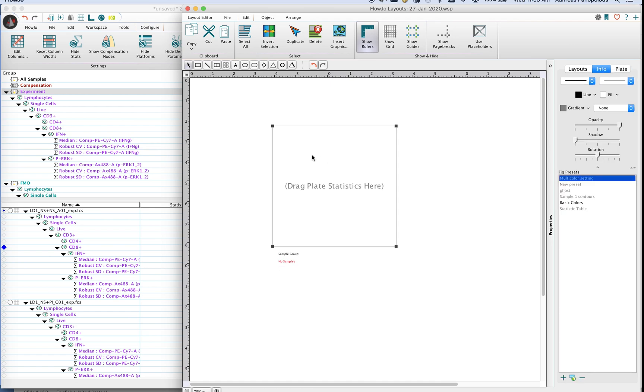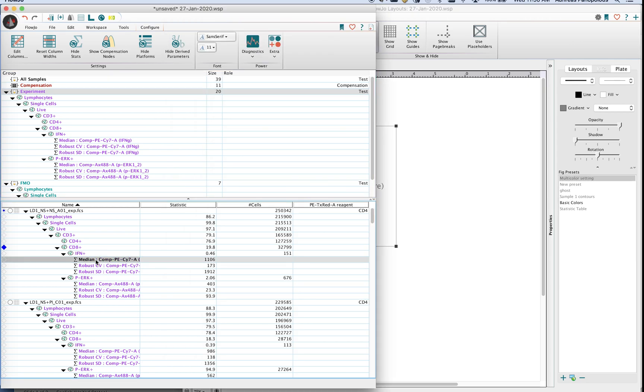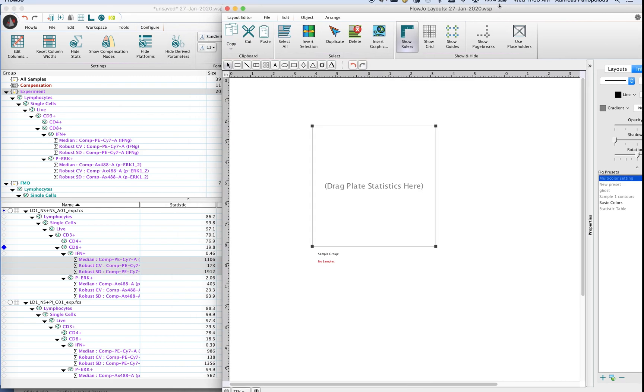This will create a box for you and then from here what you want to do is you need to feed this statistics in order to be able to visualize them. So we go back to the workspace here, I have a series of statistics. You'll notice that underneath the interferon positive population I've got an MFI and I've got some CVs and standard deviations.